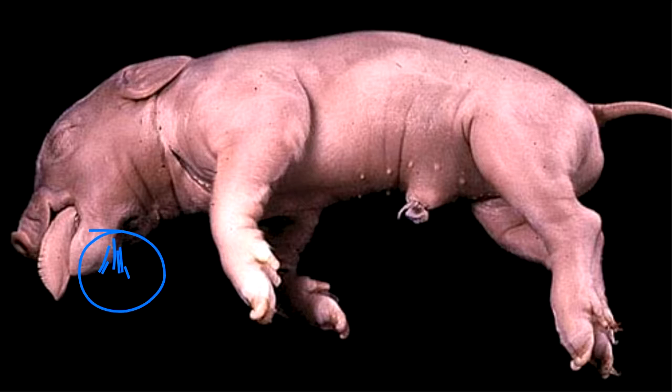As they get older, they are completely covered in fur. The book also asks you to identify the location of the heel. So here's the heel, right? The fetal pig is an ungulate, which means that it's a hoofed animal. So here are hoofs. Basically, the hoofs are the toes. So this is an animal that walks on its toes, not the whole foot.